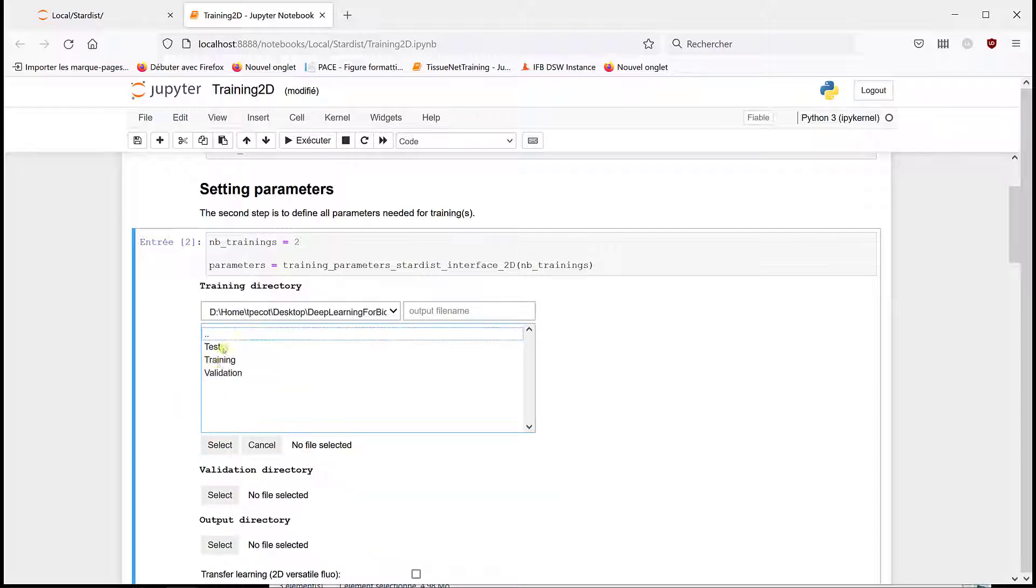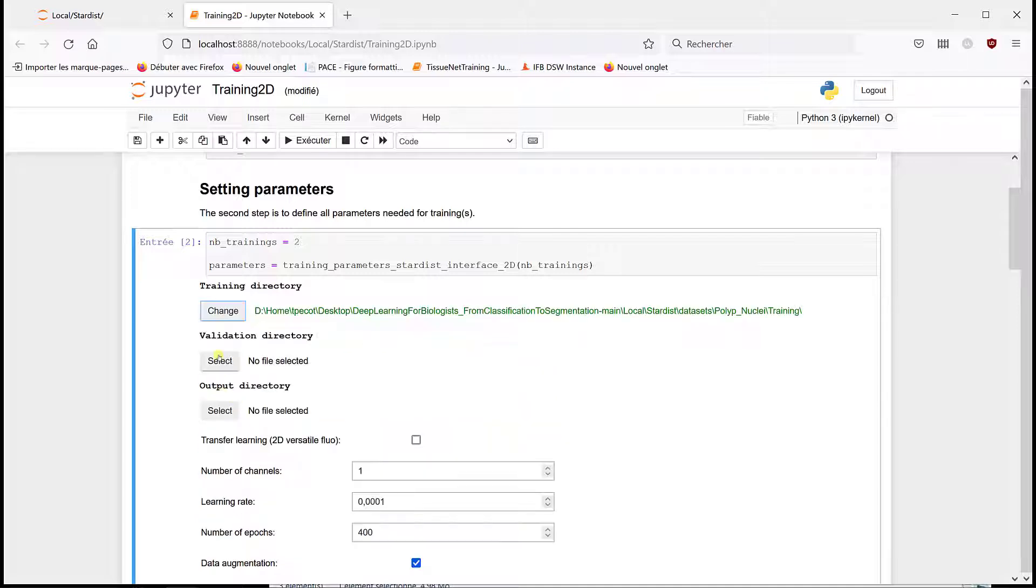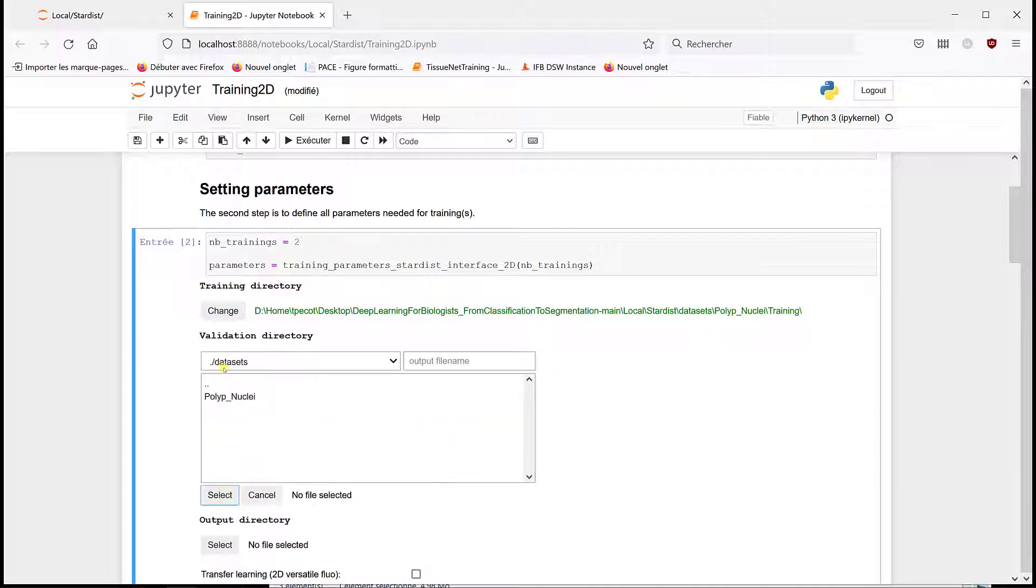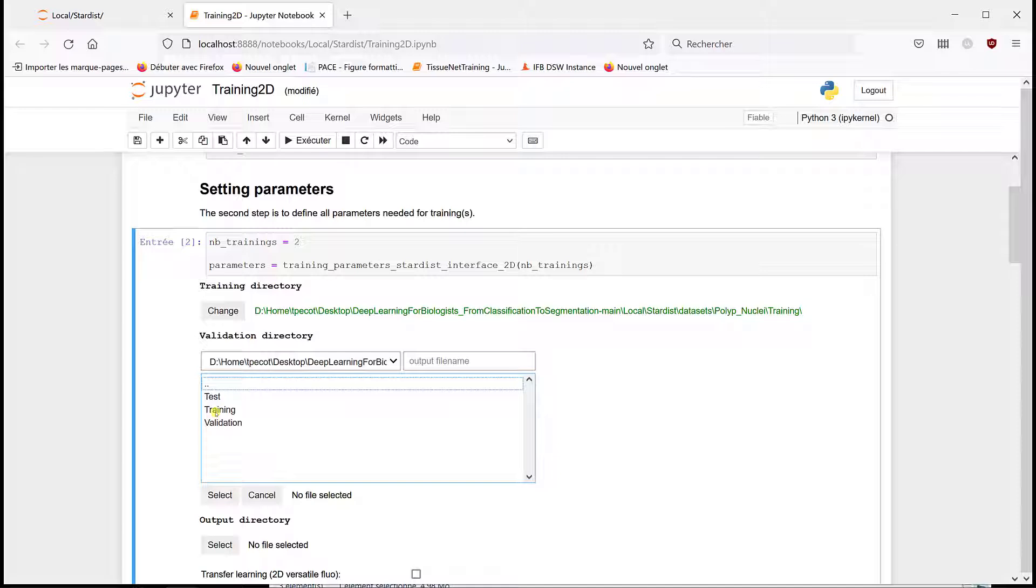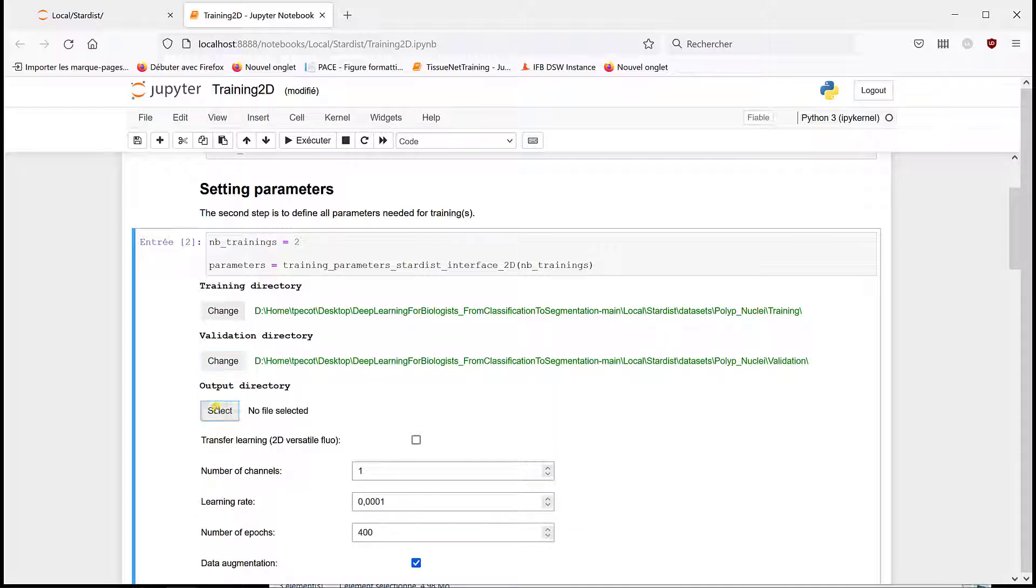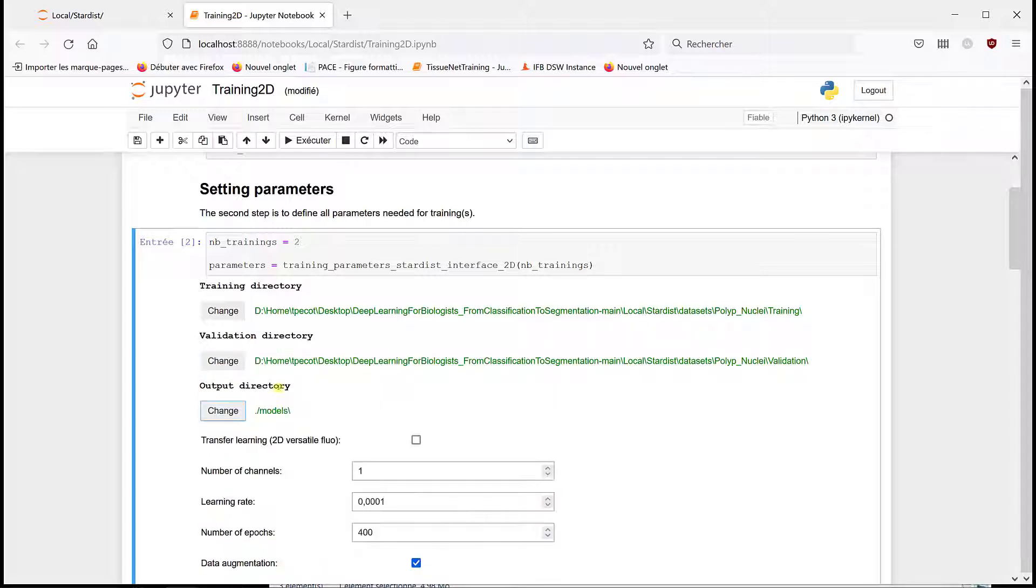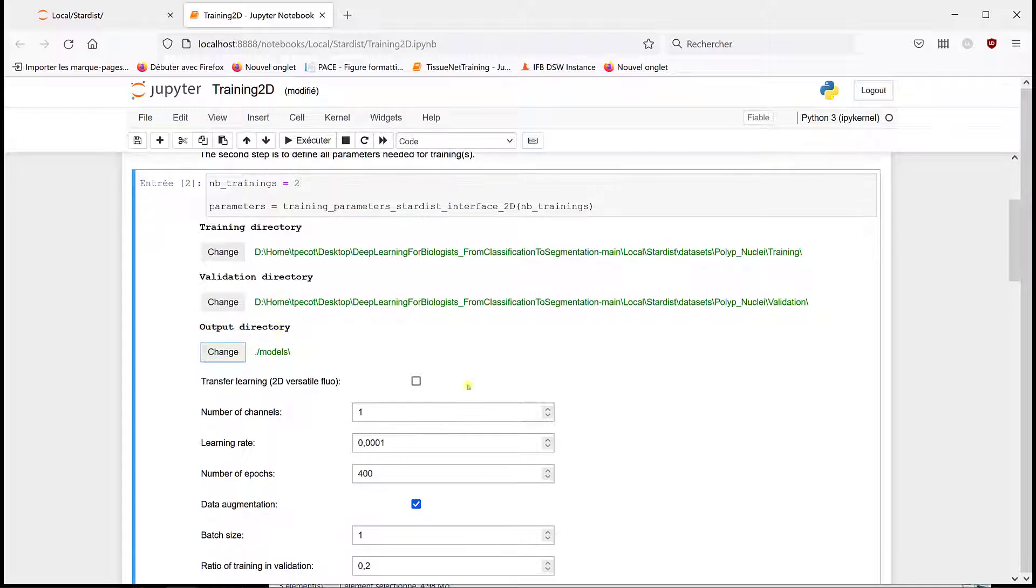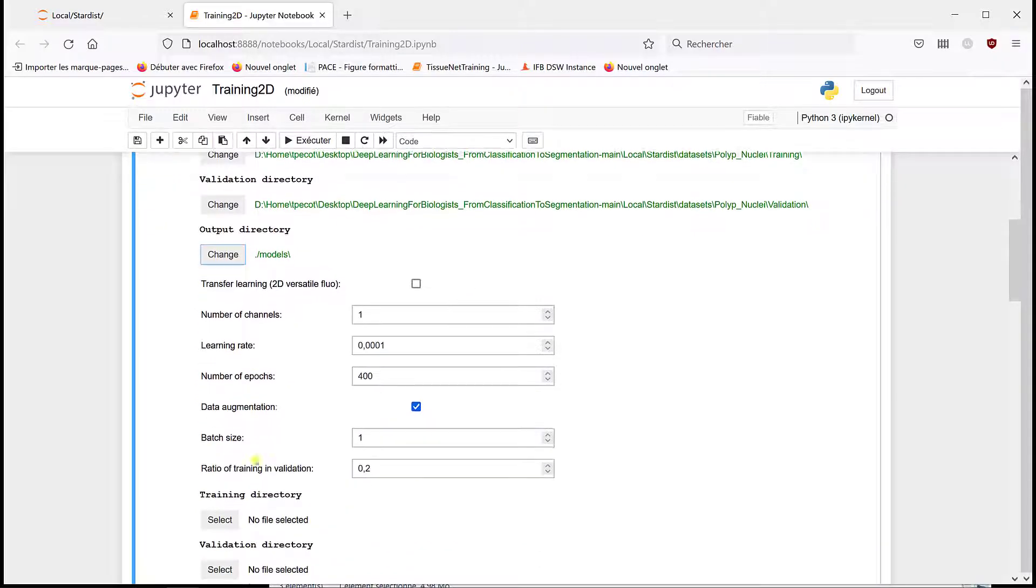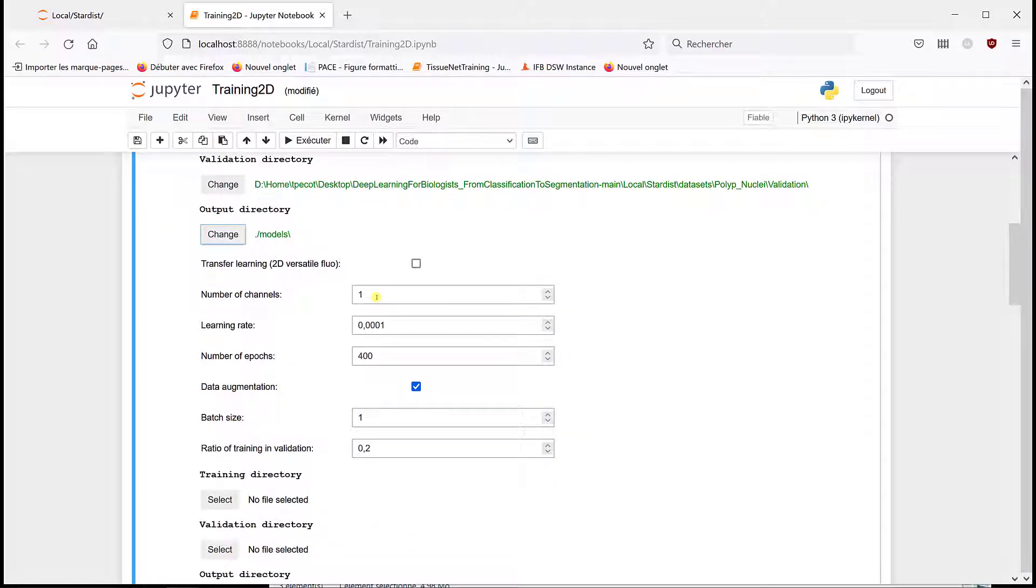So the training directory, it's polyp nuclei. These are the same folders that we use with U-Net to do the various limitations or validation, and we're going to put it in models. Without transfer learning, we have one channel, it's just the DAPI.